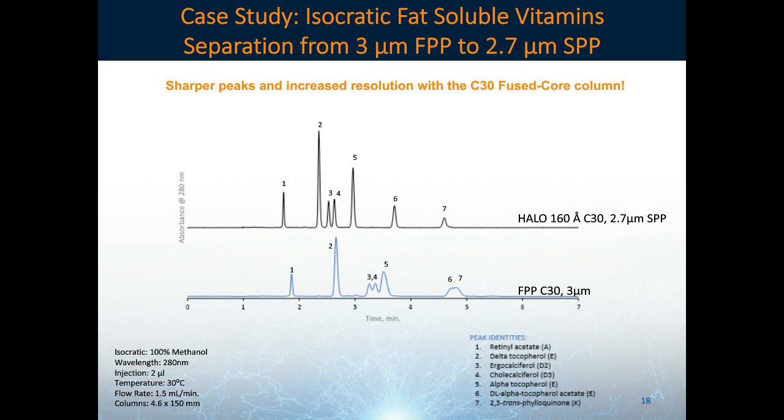And again, this is just an easy one-for-one swap. We didn't change any column dimension or condition. They're run under the same conditions.